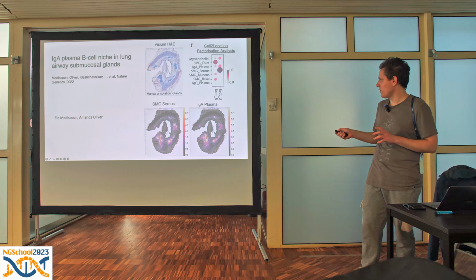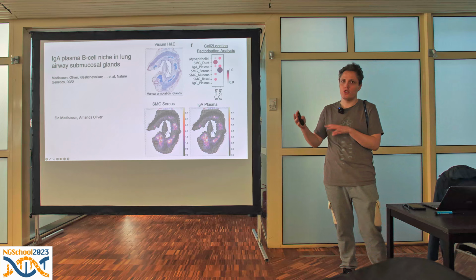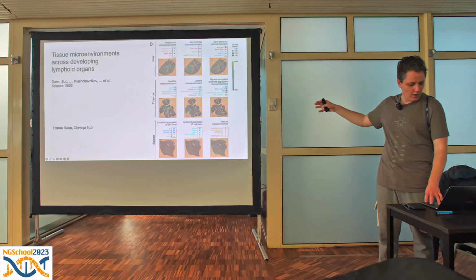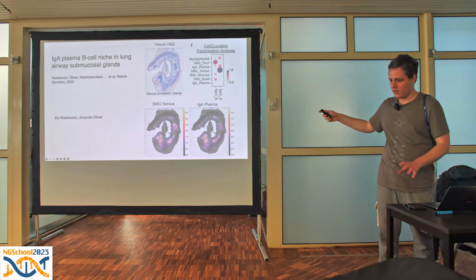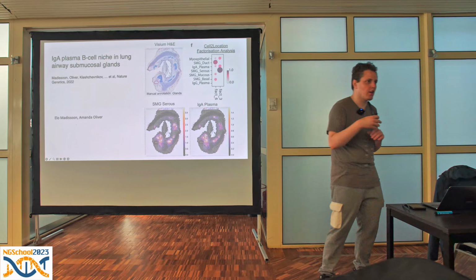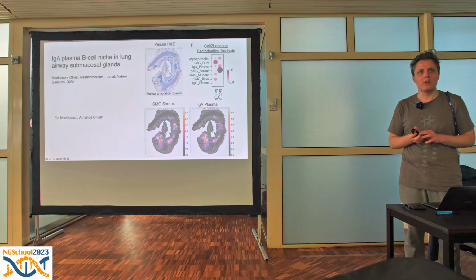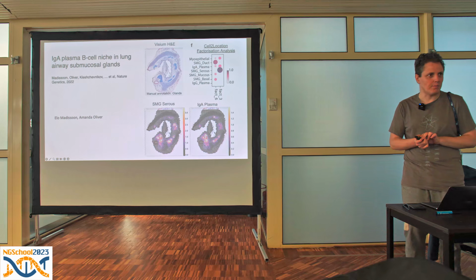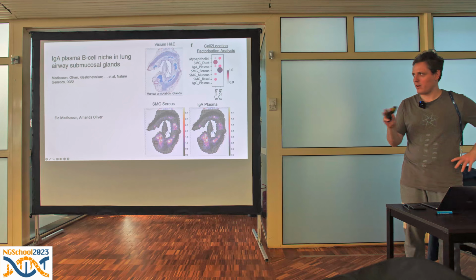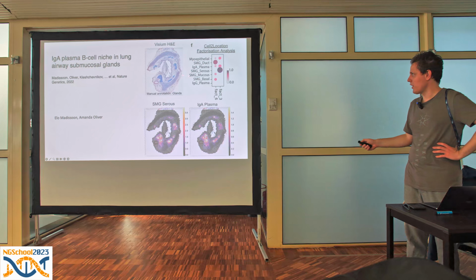And this is an example from the factorization analysis showing that we can try to recover the same. But the point I want to highlight here is that in addition to more automated analysis, as shown in this example, what we can do is histological annotation and then comparing spatial transcriptomics to the histological annotation. And there are now methods popping up that allow you to do this automatically. For example, work from Nadav Yayon in the Teichmann group. If you look him up, I will post some links to this. And he's proposing some ways to automatically create annotation of the tissue.